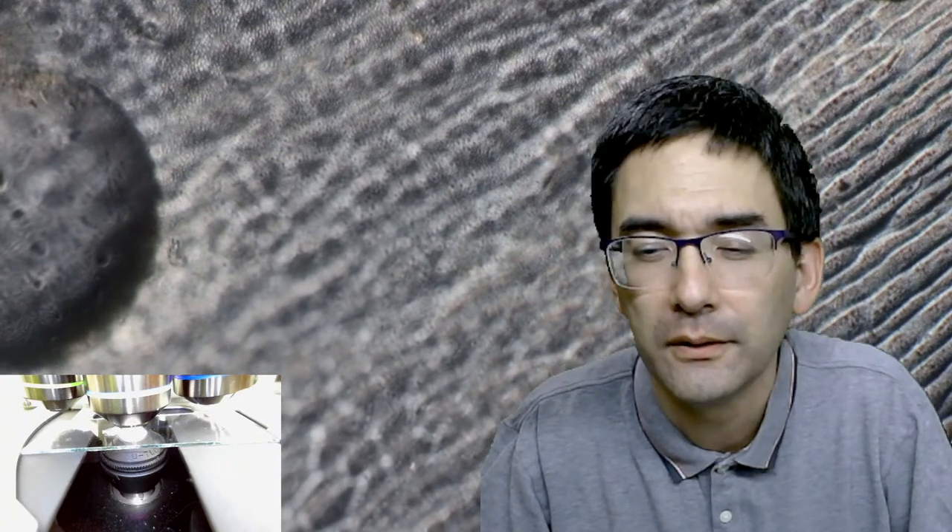The bottom part of the leaf contains the spongy mesophyll with air spaces leading to the stomata. The stomata can open and close for water conservation - during night when there is no light the stomata close and water cannot evaporate. Some plants have a different mechanism, but that's generally the way it is. I think those round things could be the stomata.